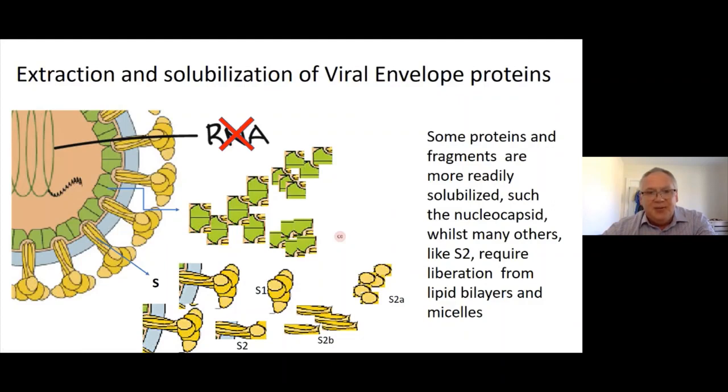I'm sorry, I can't tell you all of that information. It is something that we will let people have, but not quite yet. But we're very good at solubilizing these proteins and releasing them, and they fragment quite nicely so that we get them breaking apart, because most of these are held by hydrophobic, non-covalent associations or dithiothreitol-sensitive linkages, disulfide linkages, which you can easily break.